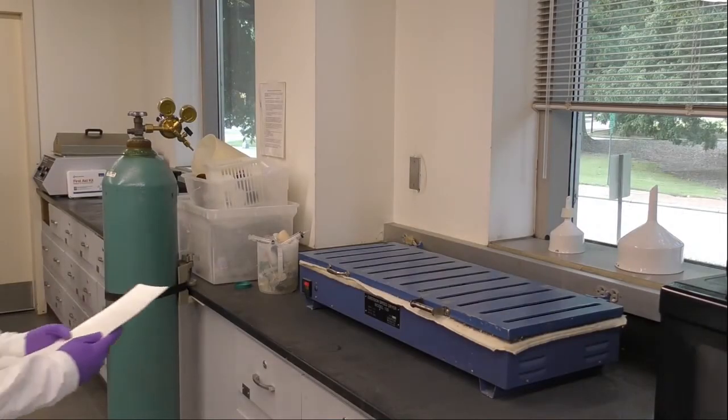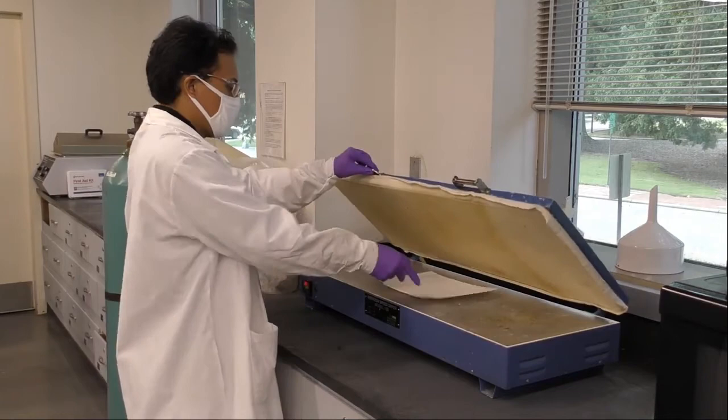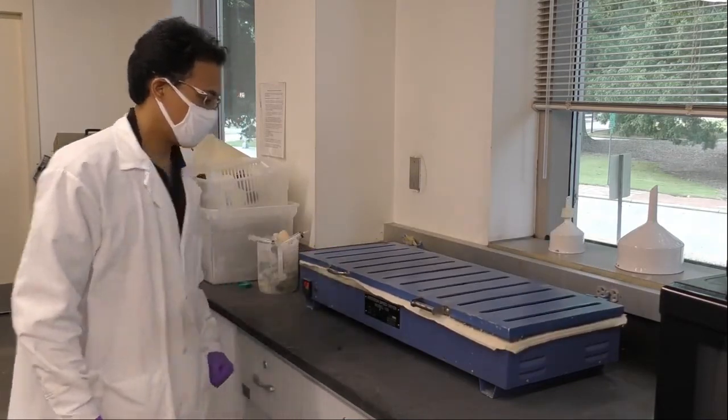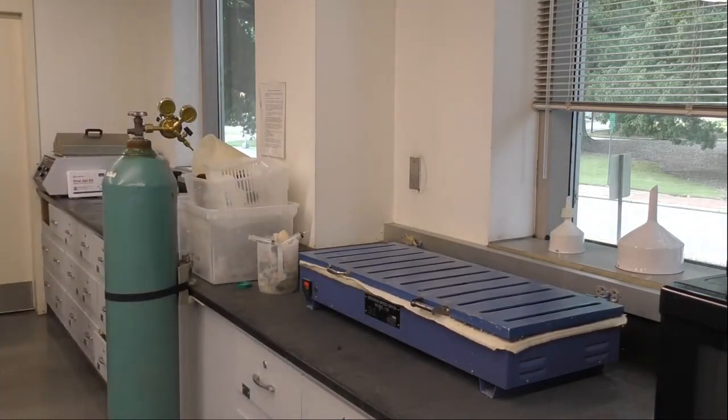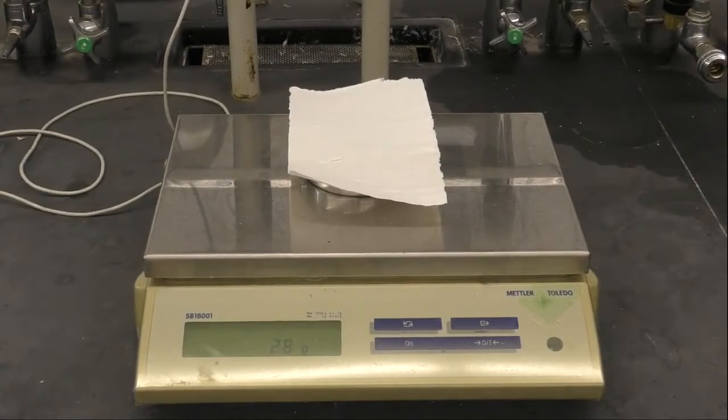Now let's dry our hand sheet paper. Make sure that it is in between two blotter papers and put it into the fast dryer for a few minutes. Now that our hand sheet is dry, it's time to weigh it. Make sure that you are recording this number for the calculations.